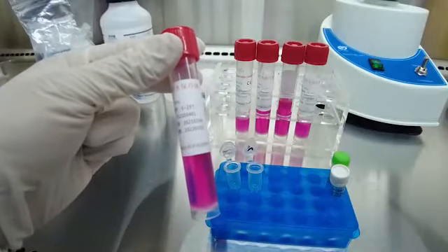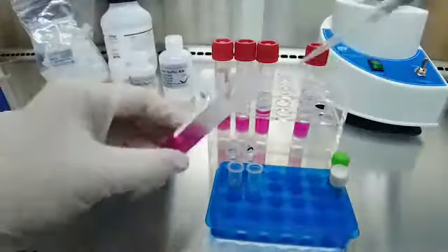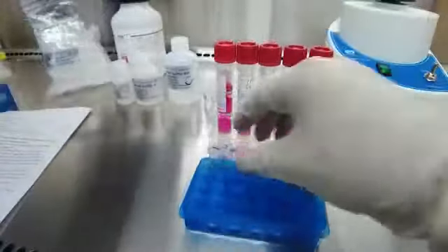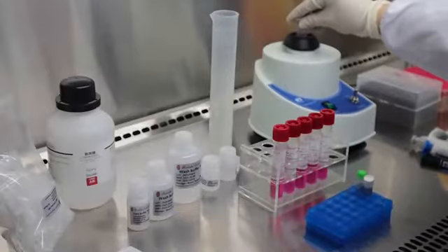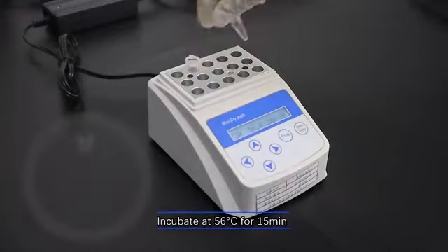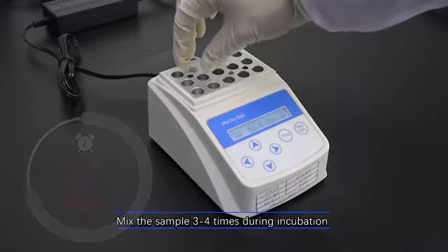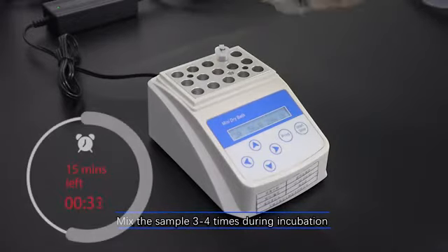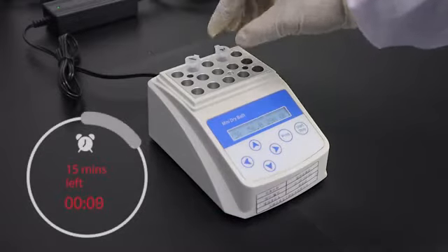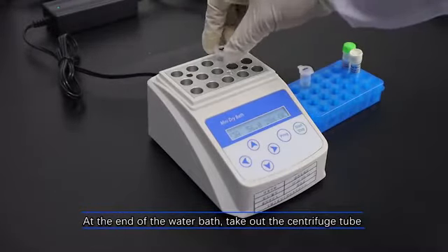Add 200 µL sample to the centrifuge tube. Add PBS buffer and mix well.